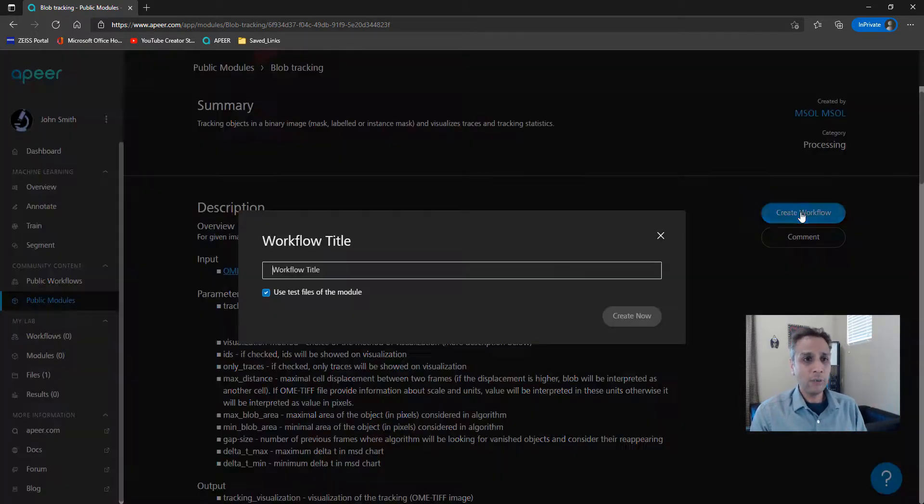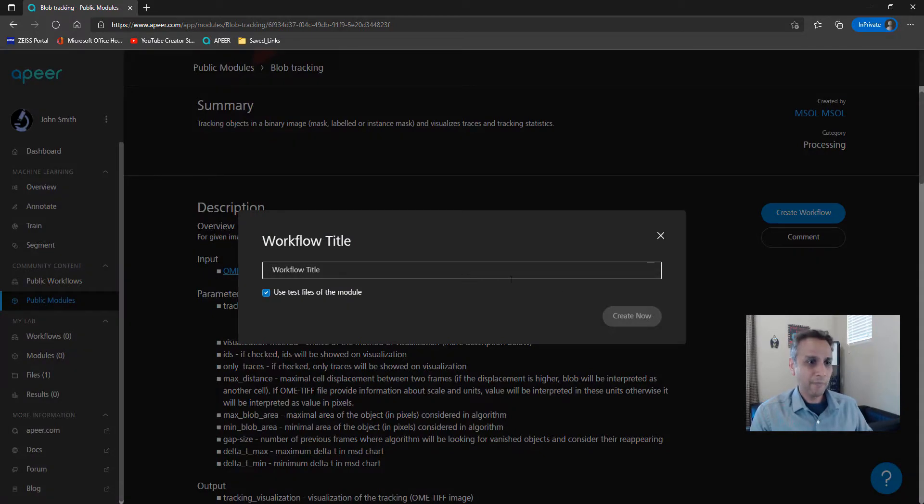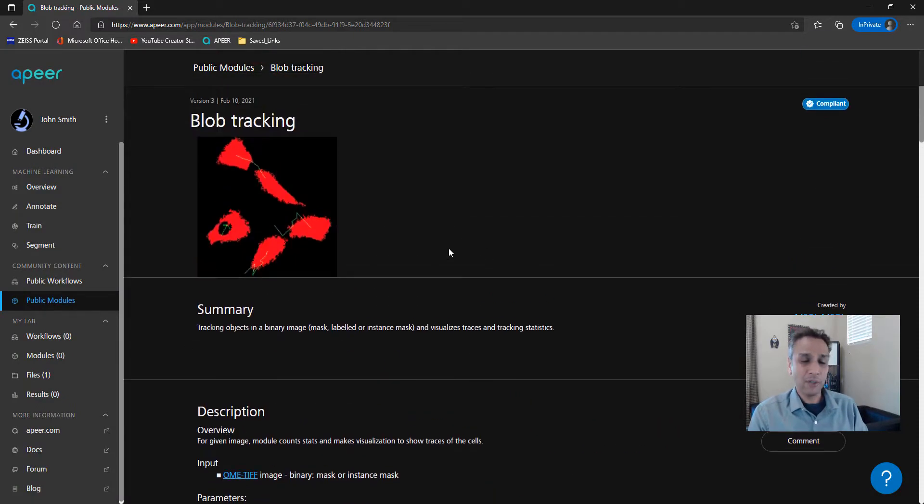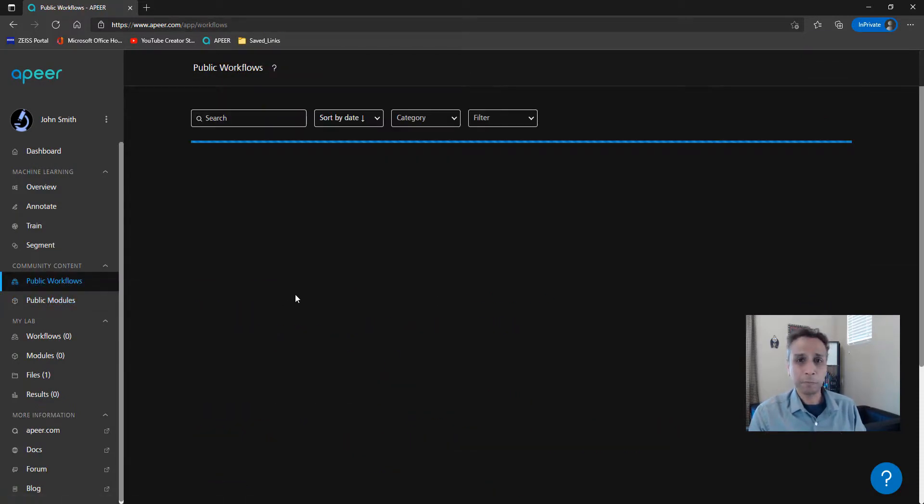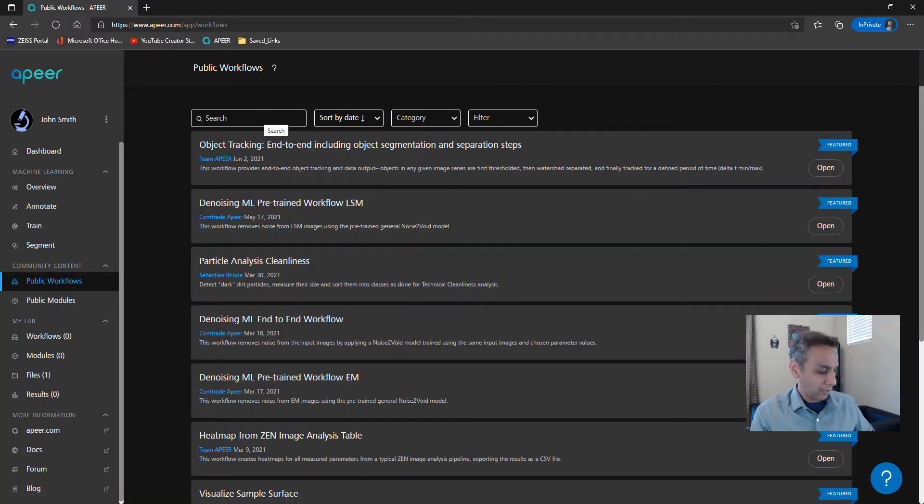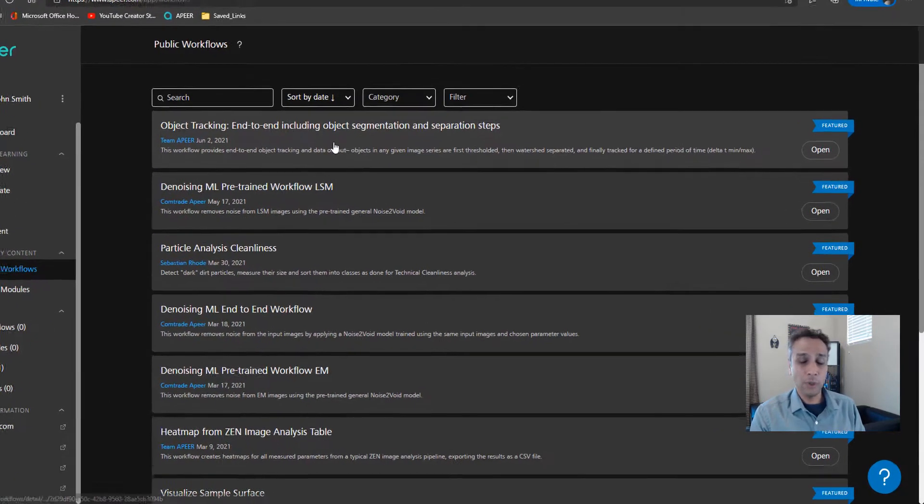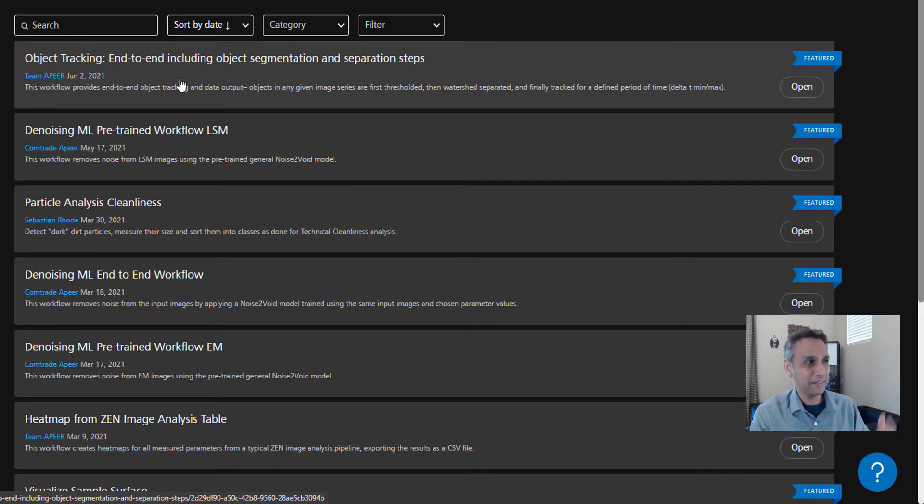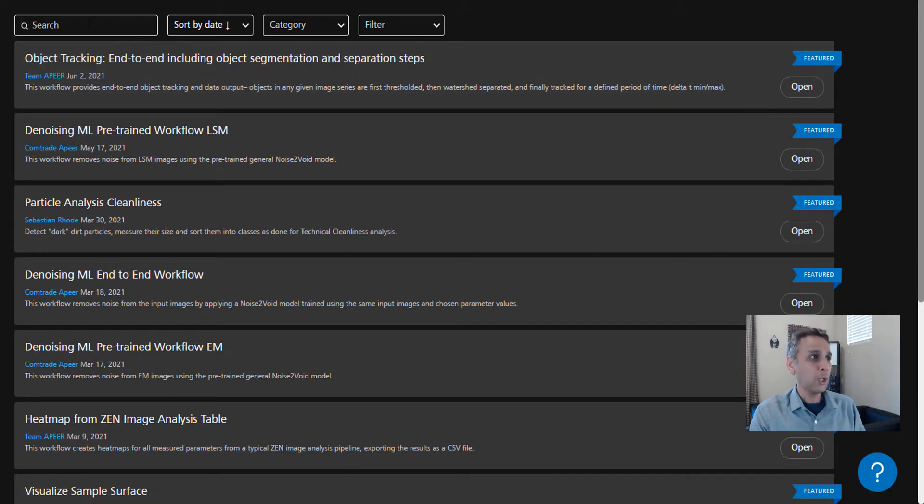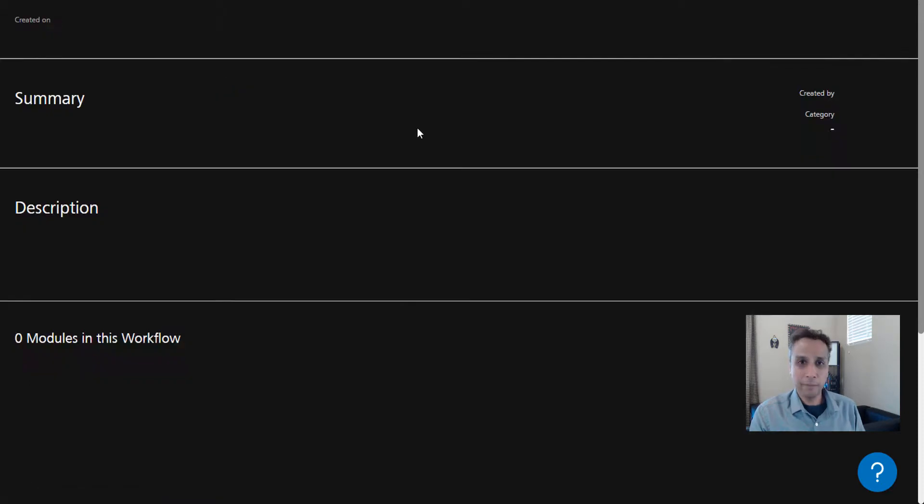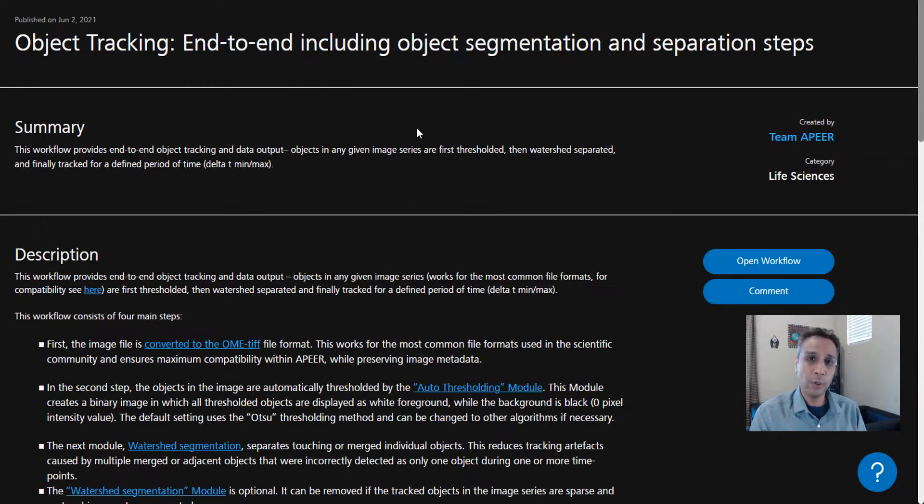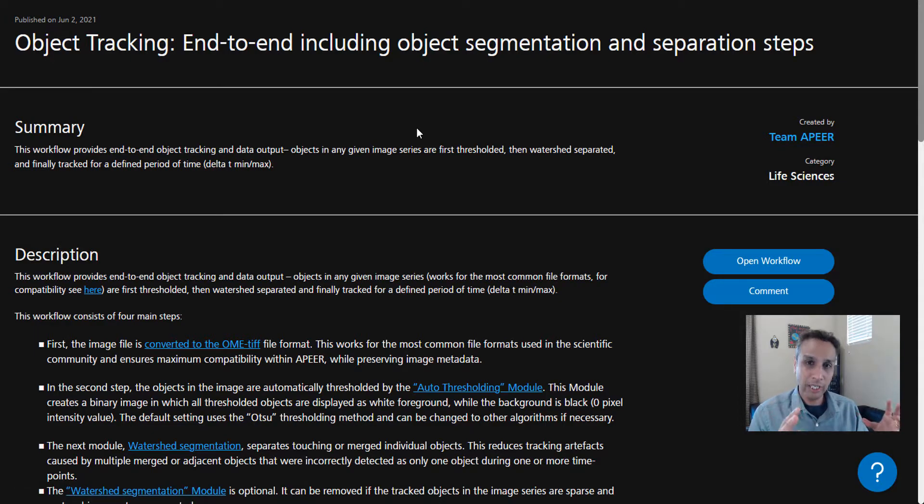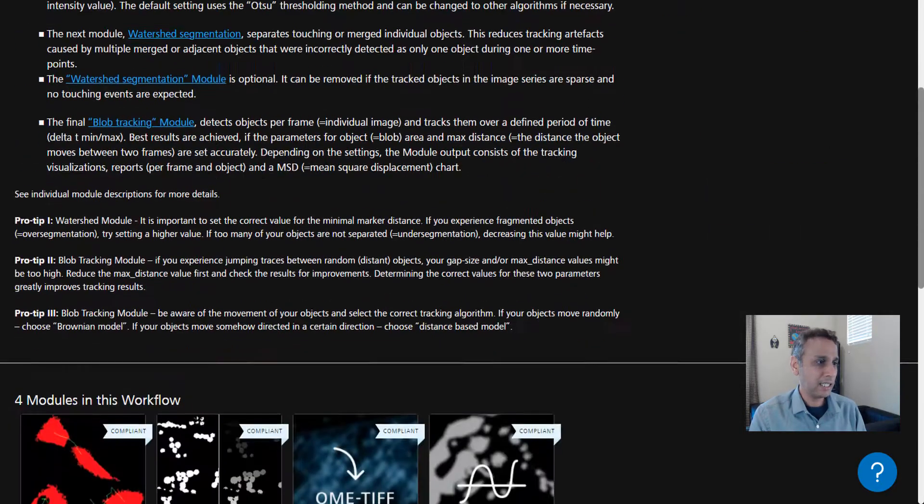In addition to the blob tracking module, we also need an OME TIFF file converter. That's the input file that this module expects. You also need a way of thresholding the image because we're starting off with a raw image, and we need watershed-based object separation. You can create a workflow by giving it a name and concatenating all these modules together. For tracking, we already published a workflow that you can use.